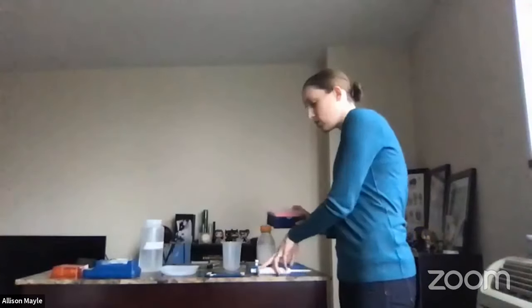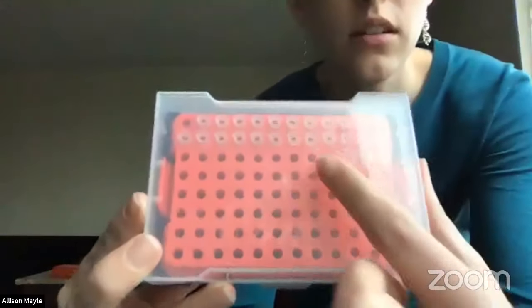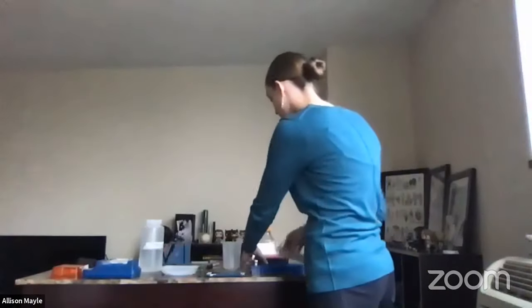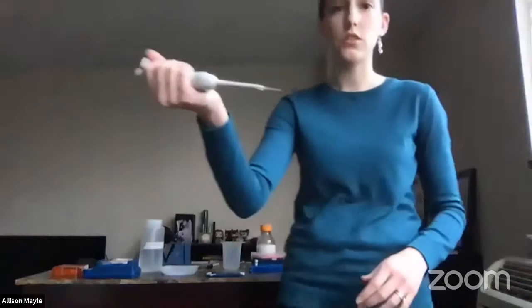We don't want that to happen. So we use these things called pipette tips. I'm going to hold it up to the screen here so you can see there's little clearish white things inside of here. These are called pipette tips. This is just like if you go to the doctor. I'm just going to put a pipette tip here on the end of my pipette. If you go to the doctor and they look in your ear and they put a little plastic coating, right?